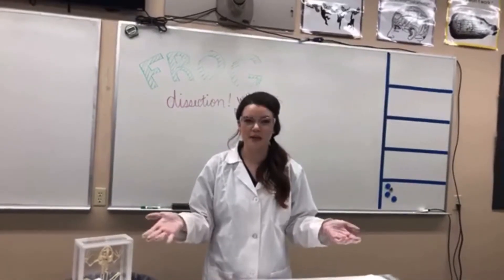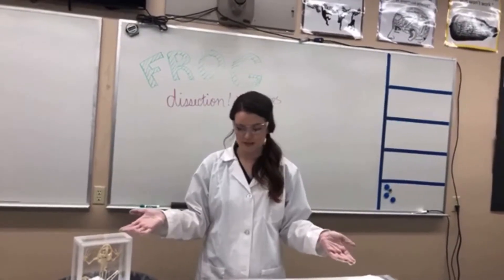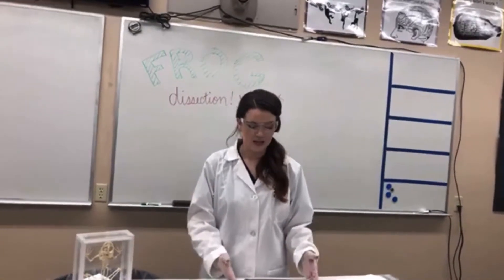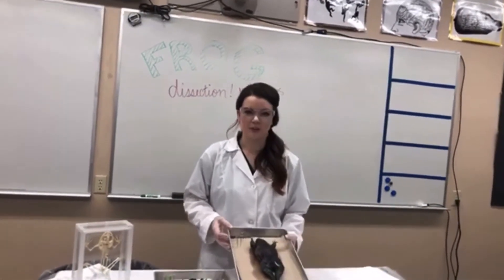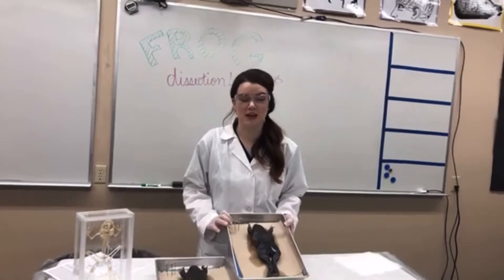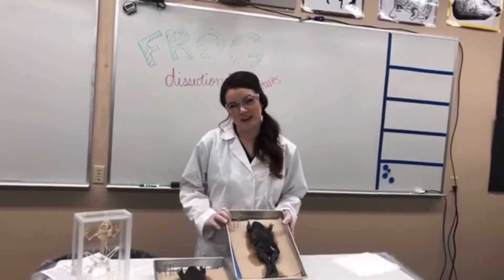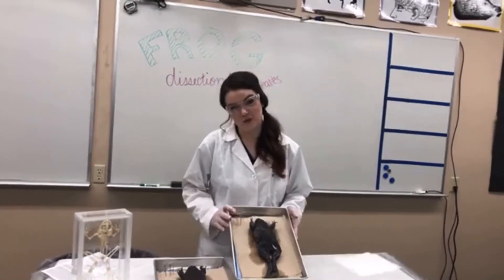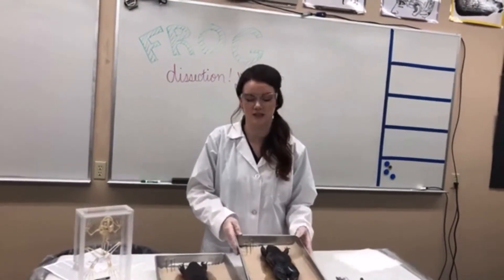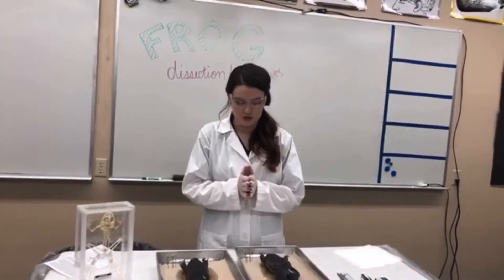I have two different specimens that we're going to be using today. Instead of just missing this opportunity, we thought it would be really fun to bring you guys into the lab and do it together. I'll just reiterate we're doing a frog dissection today. I've got a couple different specimens ready, and I'm going to walk you through what we do in middle school science - the different organs that we look for and give you a close-up view of what these guys look like inside.